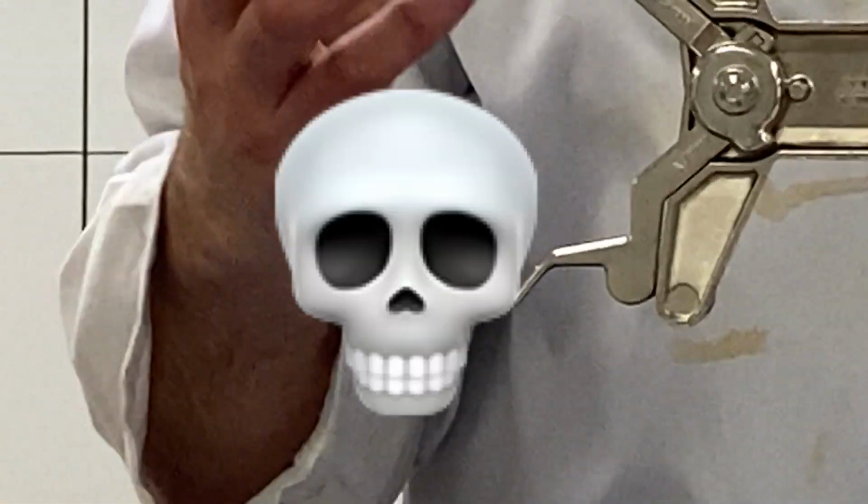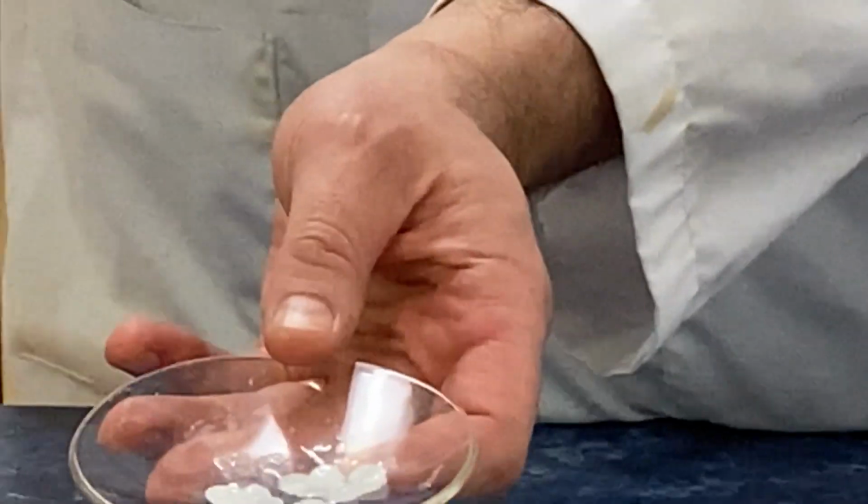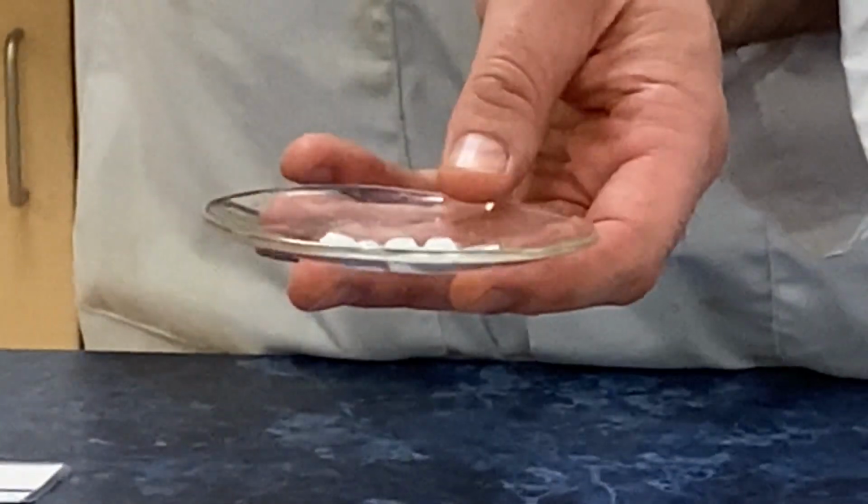Whoa, just about slipped onto my finger. That would have been very bad. Corrosive. It's very caustically corrosive. So they're all slimy, like it's absorbing water from the atmosphere, right?